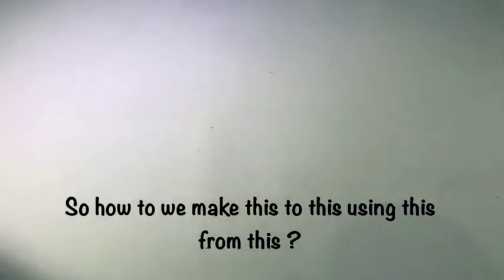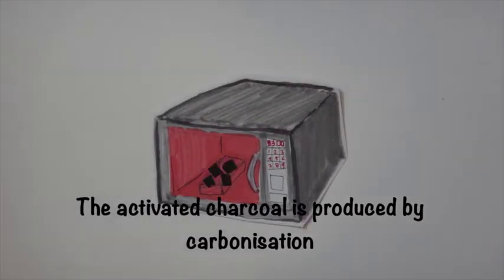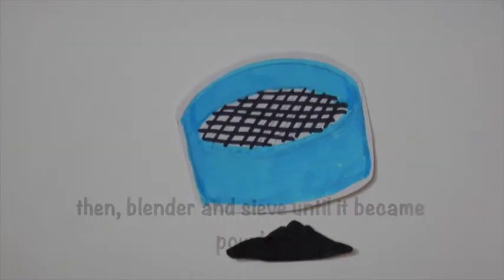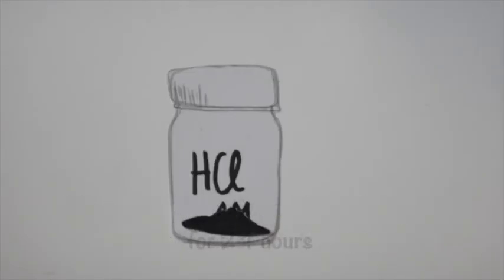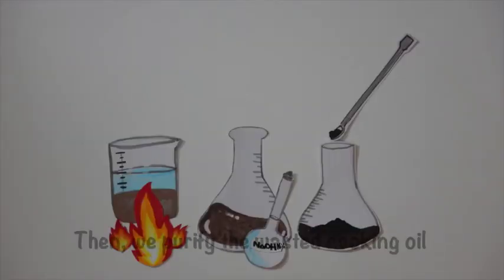So how do we make this to this using this from this? The activated charcoal is produced by carbonization. Then, blender and sieve until it became powder. The carbon are activated by soaking it in 4 molar hydrochloric acid solution for 24 hours and neutralize it by washing it using water. Then we purify the wasted cooking oil.